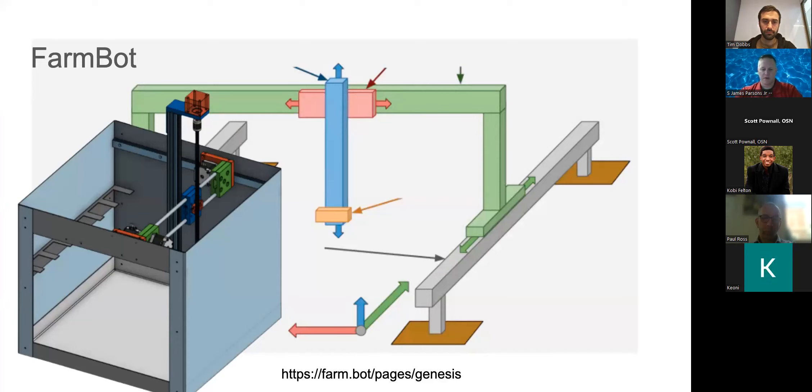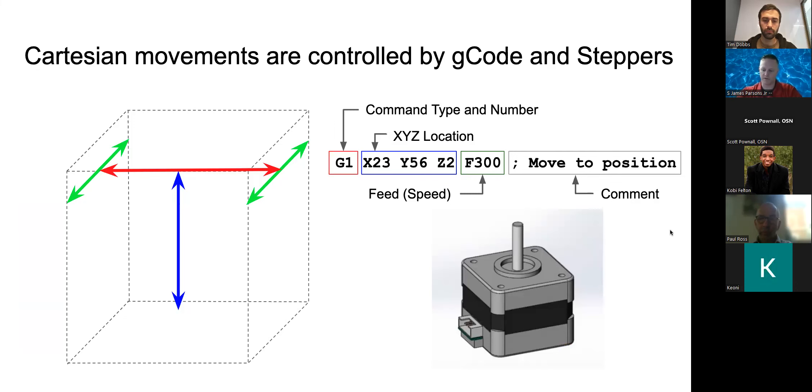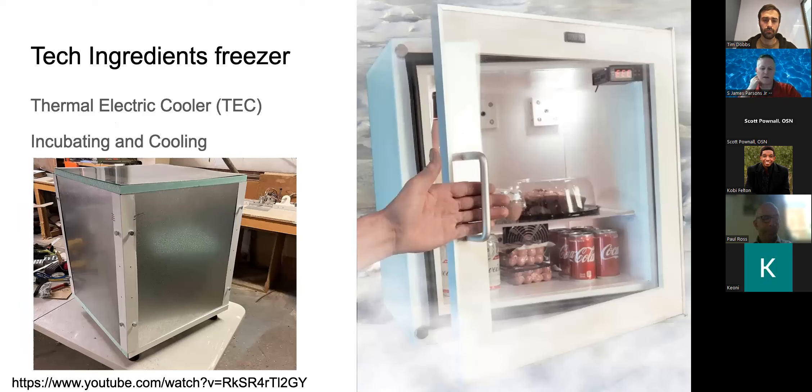Next is the drivetrain system. Version one used a FarmBot-style telescopic arm with a fixed Z-axis that went outside the build volume. The design was robust but presented challenges. I've also been enclosing the entire thing in a combined incubator/refrigerator using a thermoelectric cooling array, so I can control temperature to speed up or inhibit reactions — all in one unit.